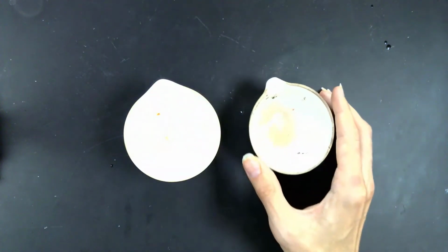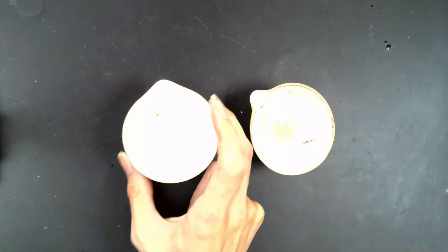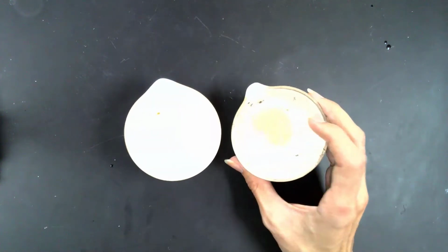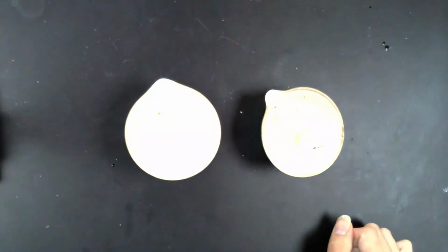So I'm going to go through probably one more rinsing, and then I will move on with the rest of the process. So I'm going to end up heating both of these samples. I'm going to heat my salt water to force all the water to evaporate, and I'll have salt crystals left behind. And with this one, I'm going to heat it just to remove any water that's kind of been trapped with the sand after I complete my third washing.